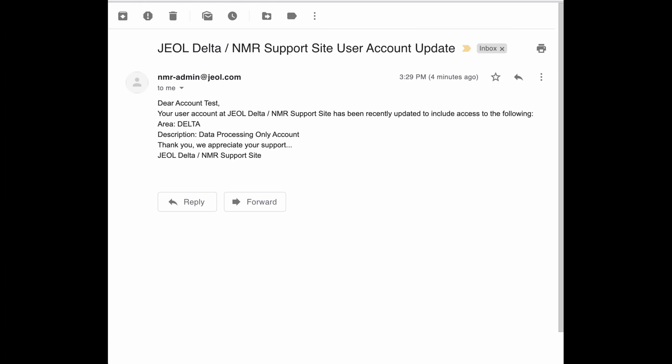Once your account has been approved, you will receive an email from nmr-admin at jeol.com with the following information. Please give up to 72 hours for account review.